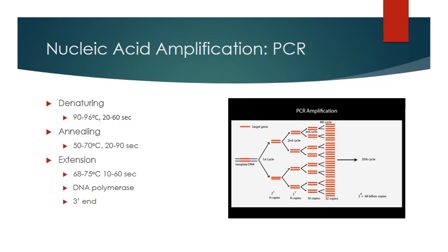The DNA polymerase is going to add one base after the other to the 3' end of the primer. So the things that you have to have are a specific primer for the sequence you want copied, the polymerase that you need to bind the nucleotides to that primer, and then you have to add nucleotides. Can't forget nucleotides. This whole thing is happening in your reaction vessel, you're changing the temperatures, and it takes a different amount of time. At the end of one cycle of PCR, you are going to have doubled the number of double-stranded DNAs that you started with.